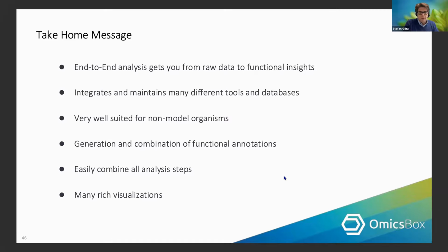So the hard bioinformatics background work has been done for you here, which also includes maintenance and it includes support. So you're always welcome to write us and ask questions. As you saw, we can do that for model and non-model organisms. So mice, human works fine, but also nematodes or plants or fish or whatever you might have.